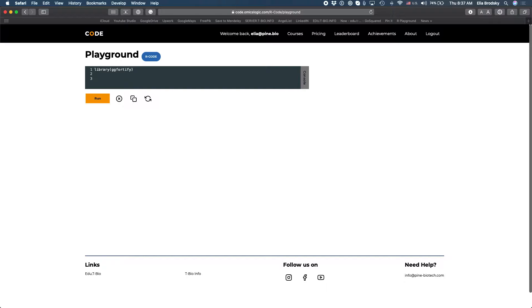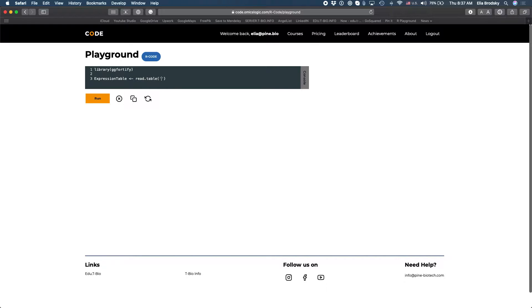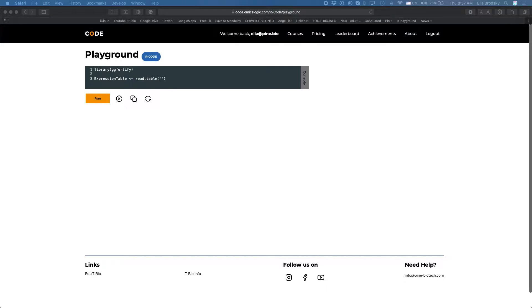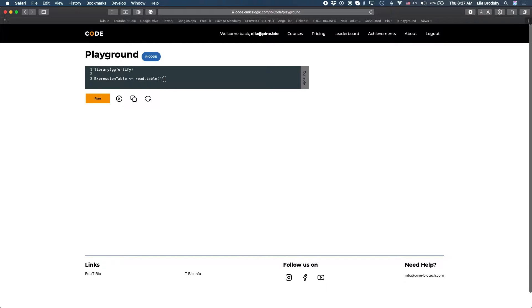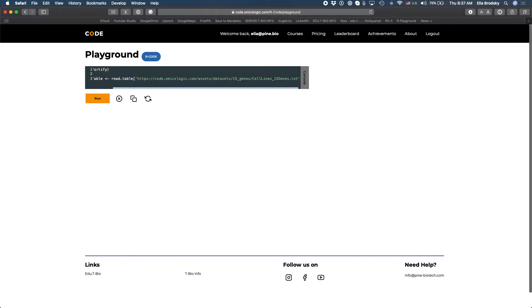So let's first of all load a gene expression table. Now I have a gene expression table already saved so I'm just going to grab that link and in this link we'll have a gene expression table for 52 samples and they will only have a small number of genes just for this illustration.